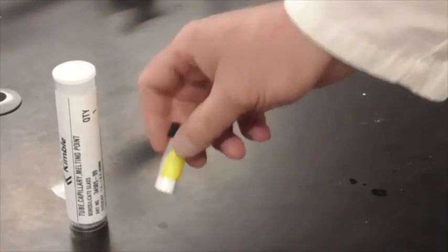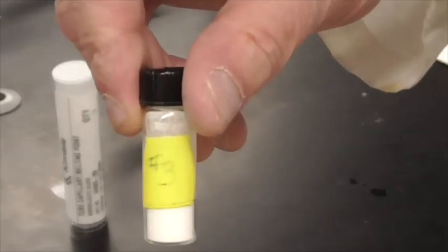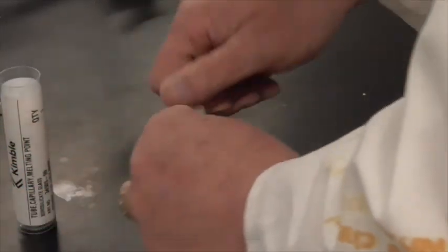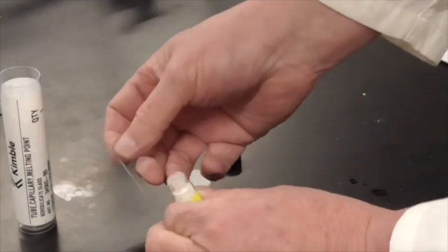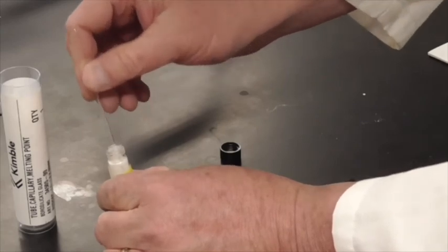Alright, so we've got our unknown here. It's unknown number 3, and we got to prep 2 samples of that using the capillary tubes. So let me get one here, and we'll prep one and then the other. Again, we're just going to push the capillary tube into the sample. The open end, right.